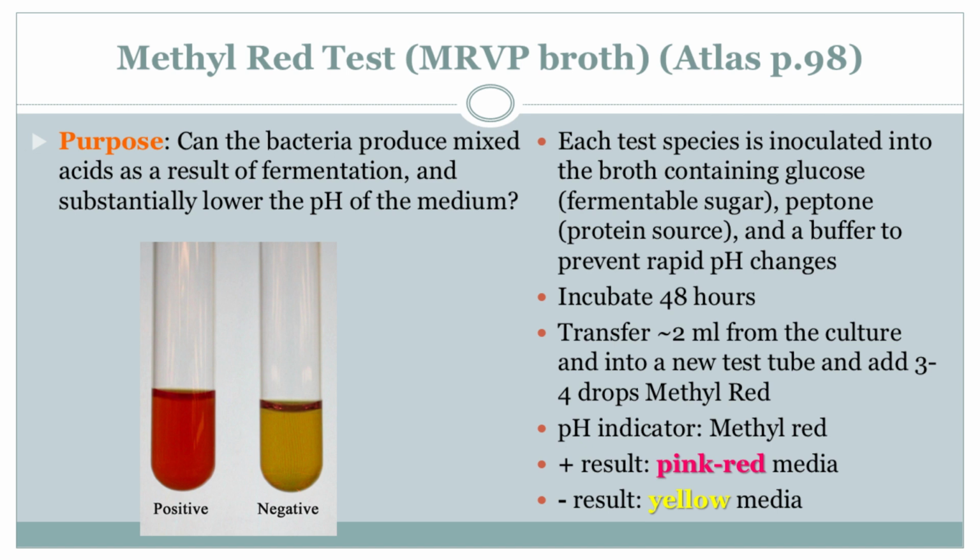Now let's compare that with Enterobacter aerogenes. Okay. It's another bacterium that's often found in the human gut. But if you did a methyl red test on Enterobacter aerogenes, you wouldn't get that bright red color change. So it's not a big acid producer. Right. It doesn't produce those same levels of stable acids, although it can still ferment glucose just through a different pathway. So it's like E. coli and Enterobacter aerogenes are both snacking on glucose, but what happens after that snack is totally different. A great way to put it.